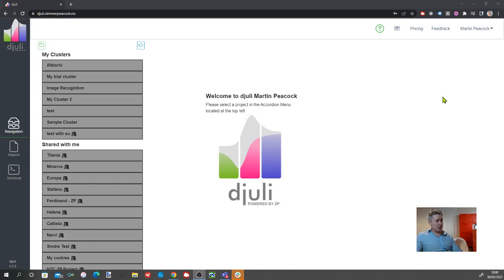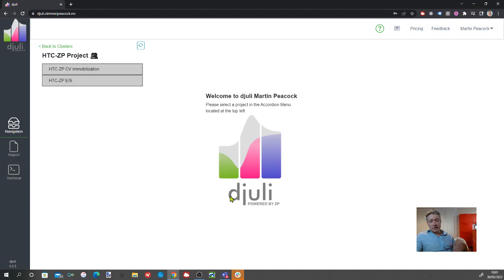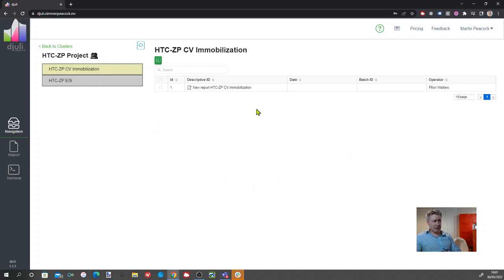So in this instance, we have a great collaborator, and what they've done is they've created, first of all, a Djuli account, and then they've created what's called a cluster, and within clusters they've created projects. So what this collaborator is doing is they're forming a biosensor. If you're used to any of our videos on YouTube, you'll see that when we're making biosensors, specifically in the case of immunosensors, we often characterize immunosensors by a series of cyclic voltammograms.